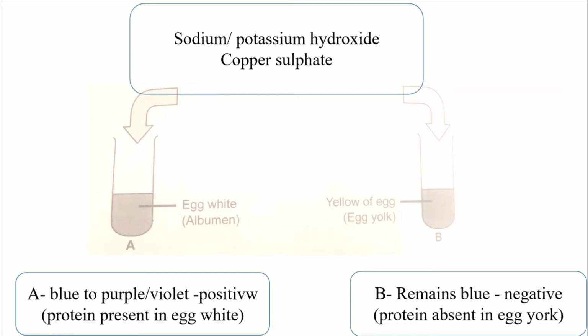All right, so you firstly add in your sodium hydroxide in your test tube. So this is 7 droplets of sodium hydroxide. After you are done adding 7 droplets of your sodium hydroxide, then you are adding 5 droplets of copper sulfate. Now when you do this, you see that your solutions will actually be blue.